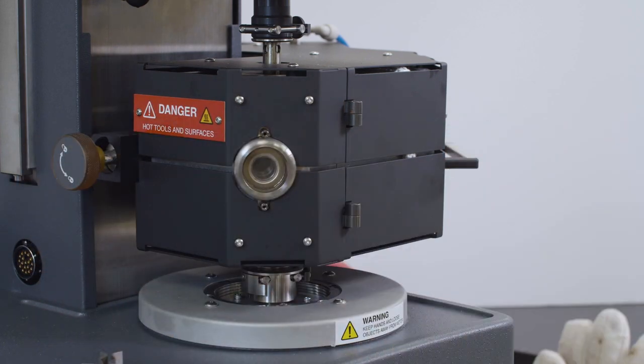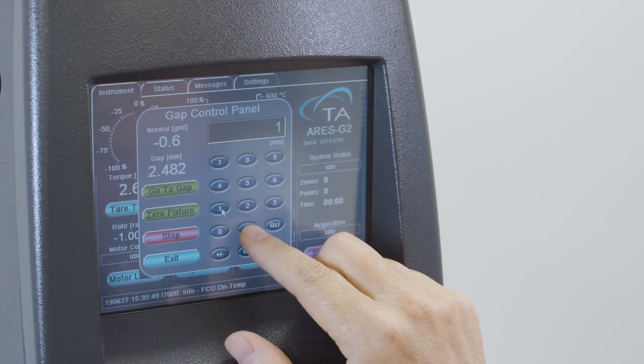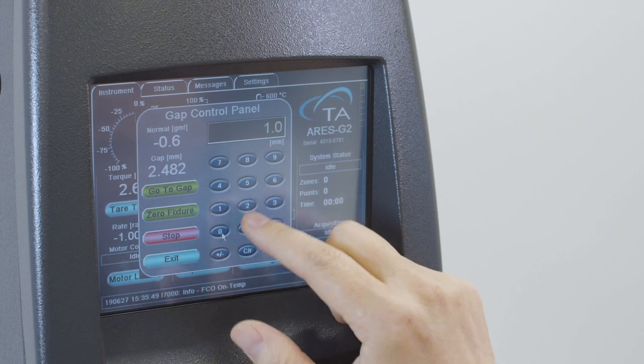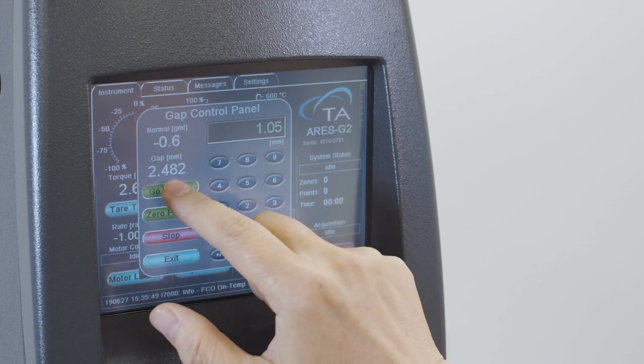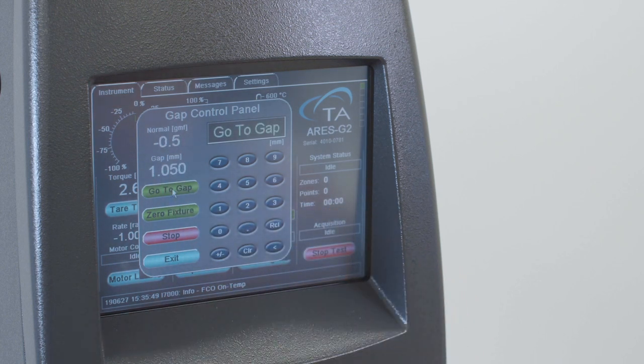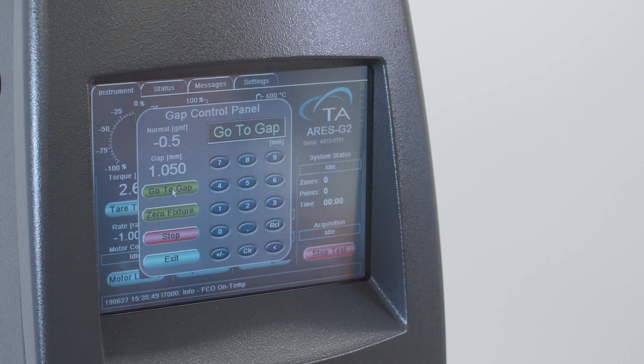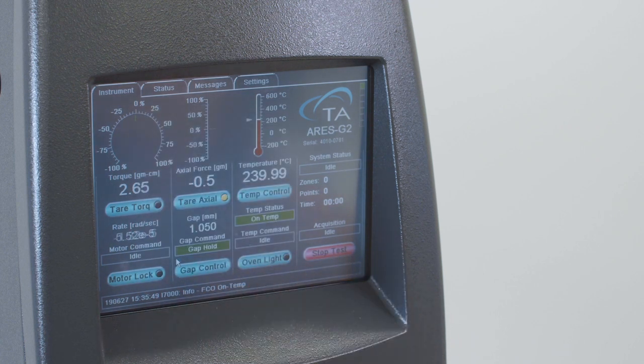Use the instrument touch screen or the TRIO software to set the geometry gap to be 5% above your measurement gap. For example, if your measurement gap is 1 mm, then you set the gap to be at 1.05 mm.